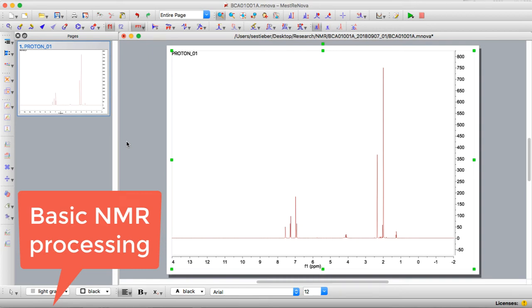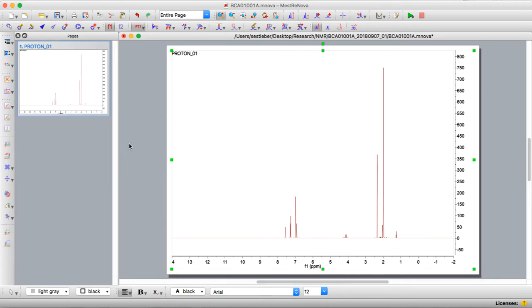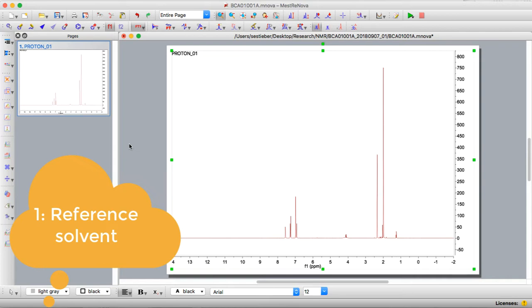Welcome to the basic MNOVA processing tutorial. Once you've loaded your spectrum into MNOVA, the first thing you want to do is always reference it to the solvent.